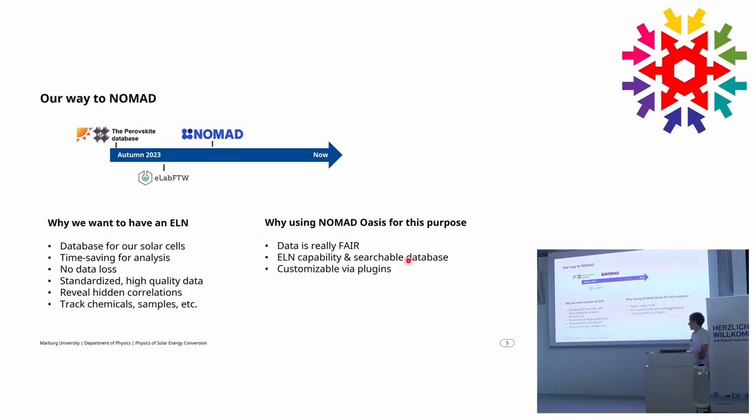And as already shown, it is highly customizable via this plugin mechanism. So I can write some Python code and change the design as I would like to have it. And also one big point, of course, it was already used in the perovskite community. So there were people here at HZB, especially Micha Götte, who were implementing the perovskite sections. So lots of work was already done, and it was a little bit easier to kick off with all the standard schemas Micha already has written. And then people at, I think, Erlangen are using it, and also at KIT. And so it's good to do something together, yeah.